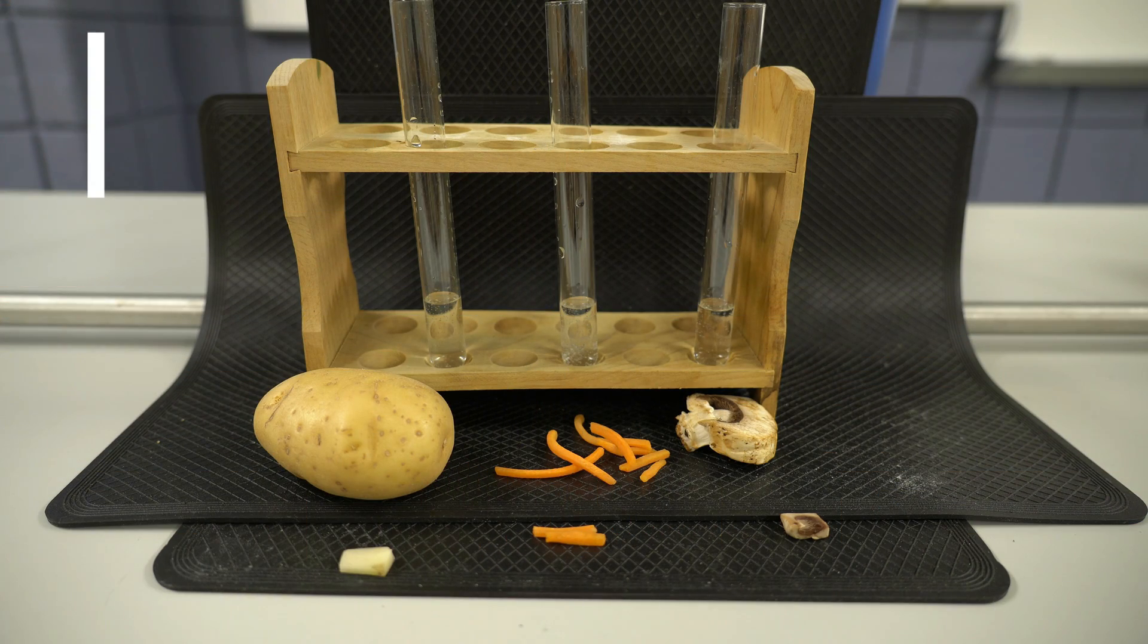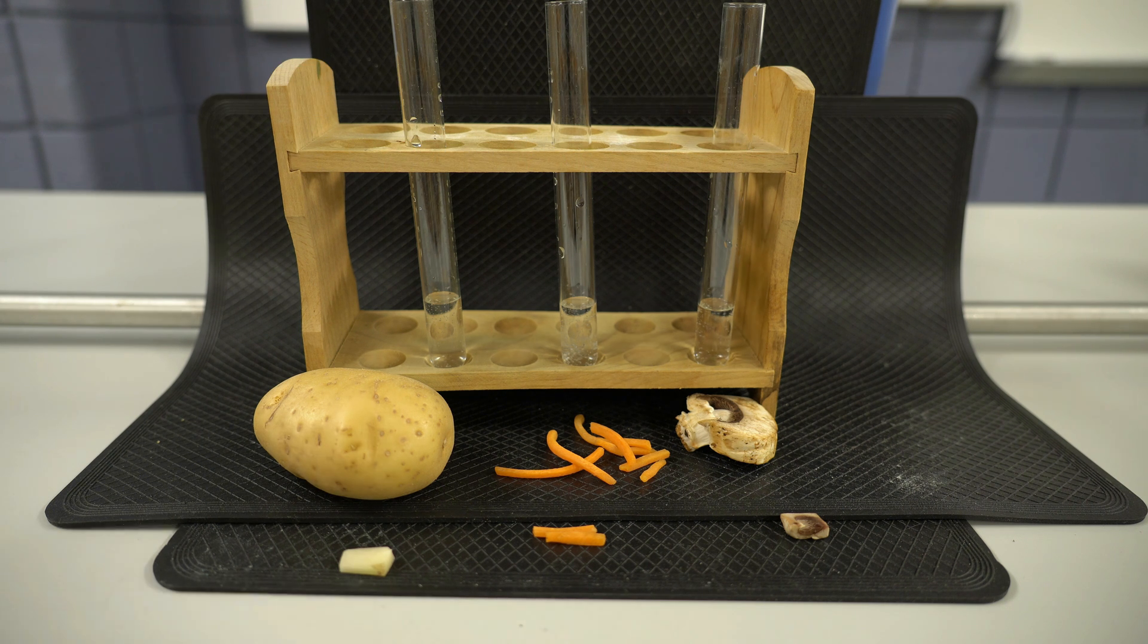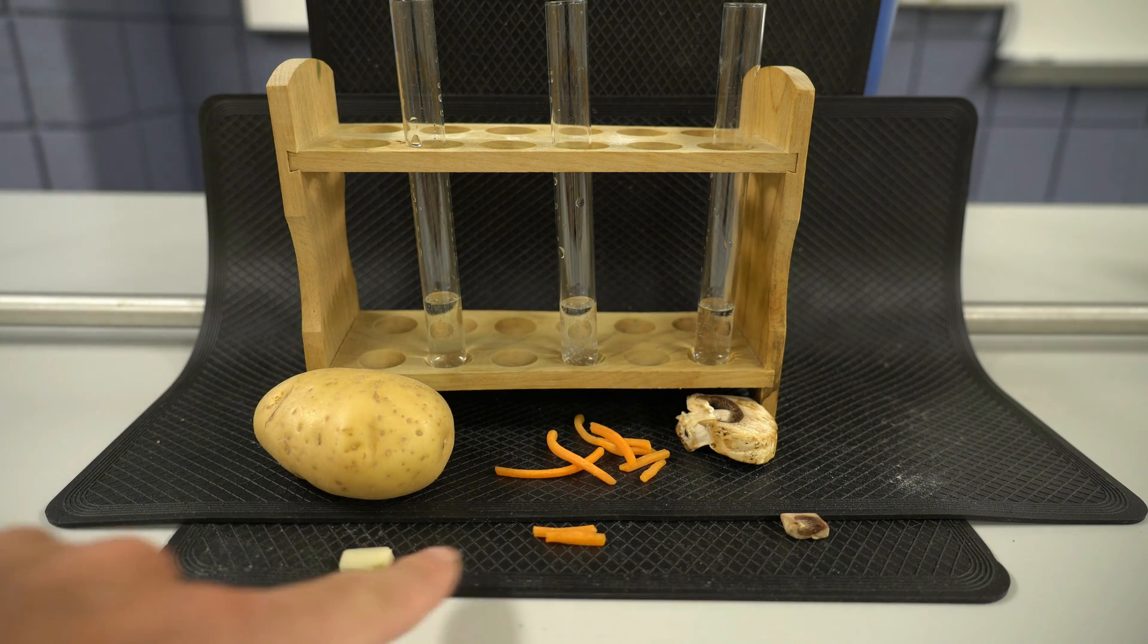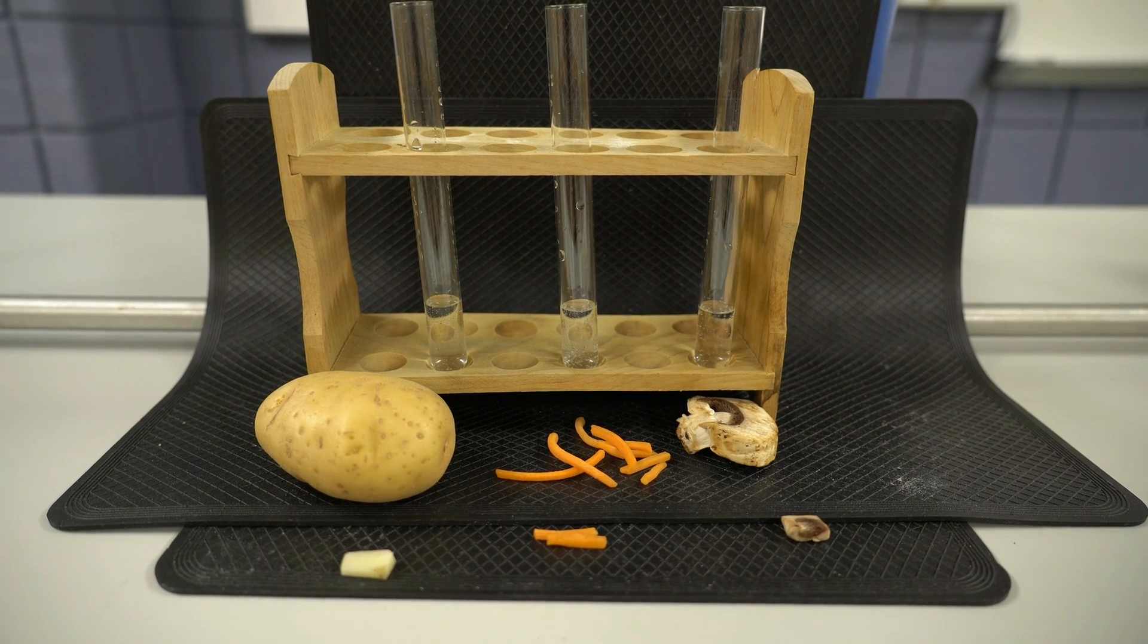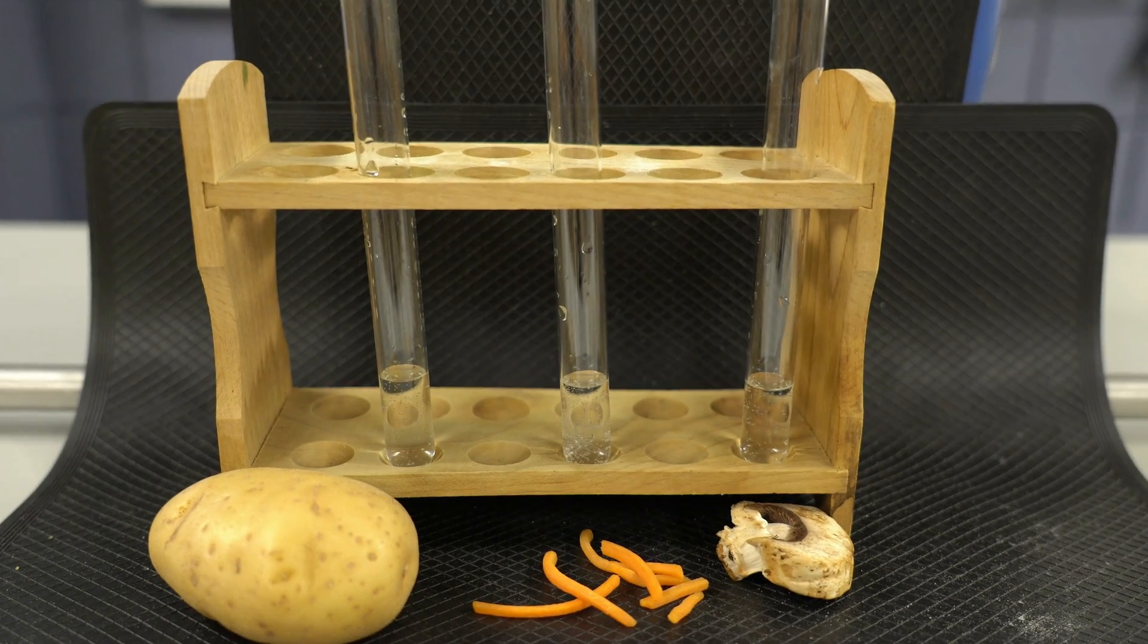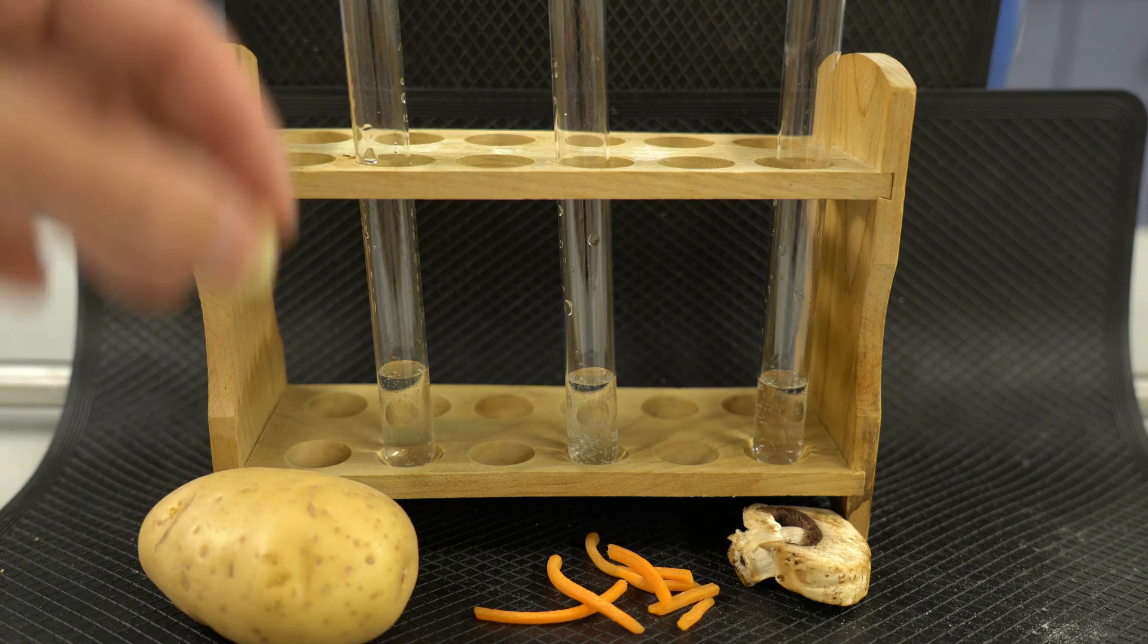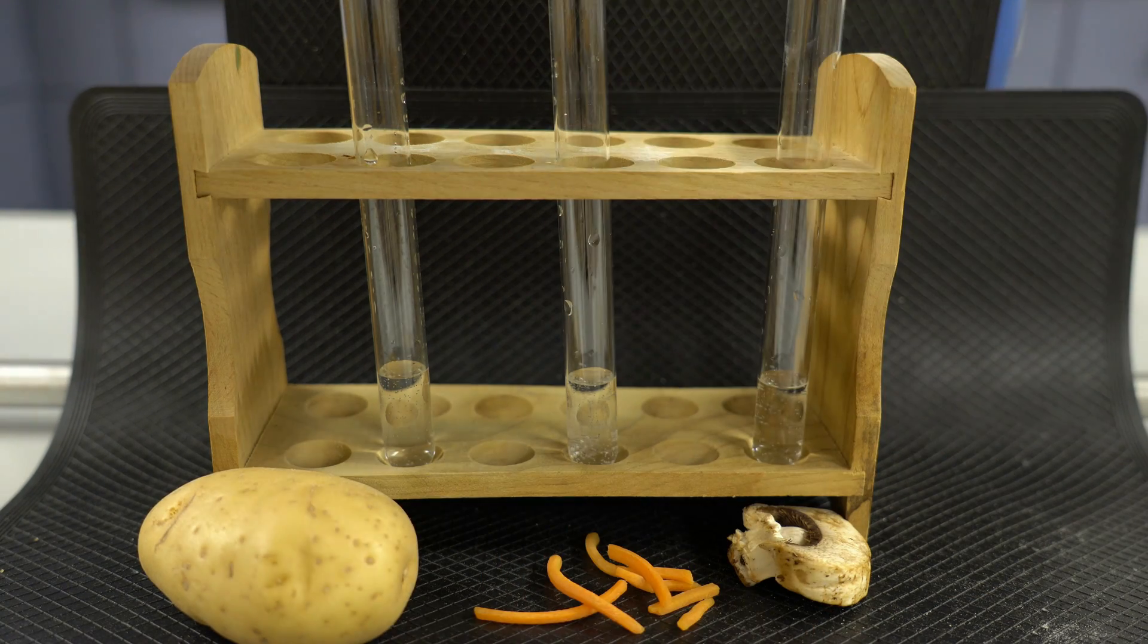So here I have some different food items, and we're going to assess the amount of catalase enzyme they have based on their reaction with hydrogen peroxide. I've got potato, carrot, and mushroom. I've cut sections here, trying to keep the surface area the same. I'm going to add them to the respective test tubes and see how the reaction rates may differ in relation to the amount of catalase enzyme each contains.